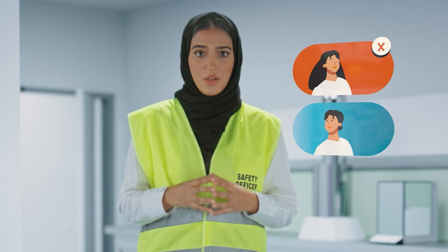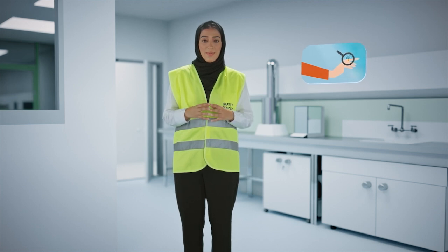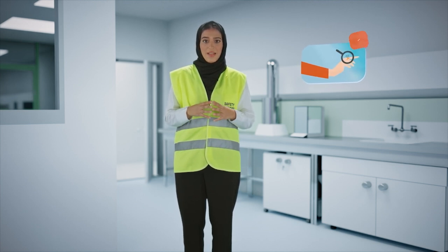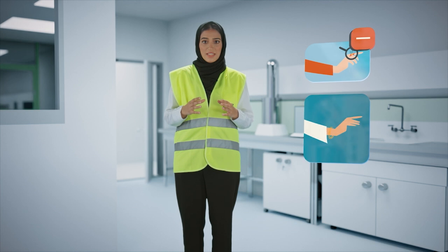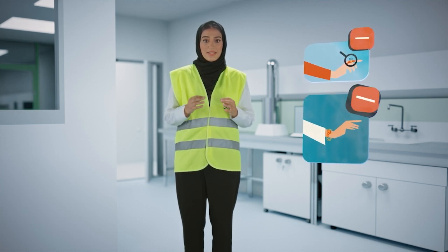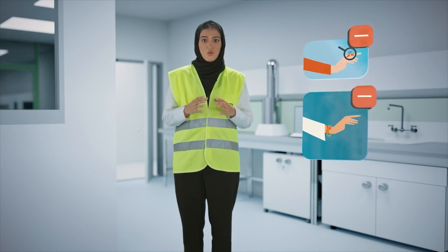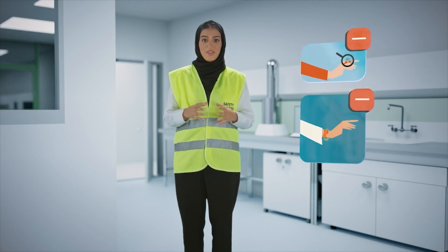Loose hair can be hazardous while in the lab, as it could impede your vision, accidentally dip into chemicals, get caught in equipment, or even catch fire. Hence, keep your hair tied back. Jewelry can be damaged by chemical gases and spills. Chemical seepage between the jewelry and the skin can put corrosives in intimate contact with your skin and trap the chemicals there. It can also catch on equipment, causing injuries. Therefore, make sure to remove all jewelry before entering the lab.